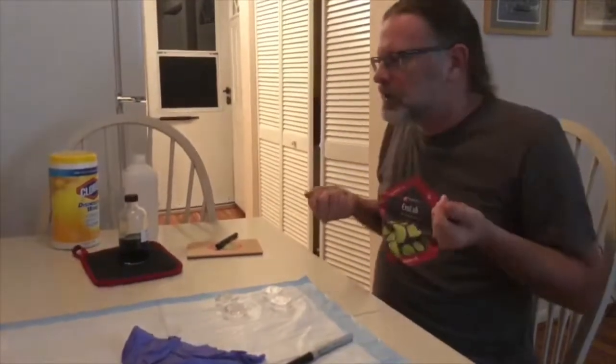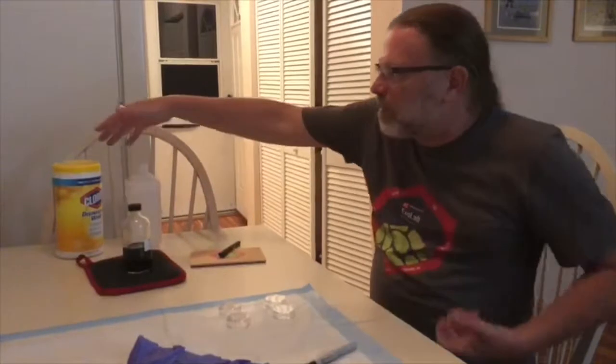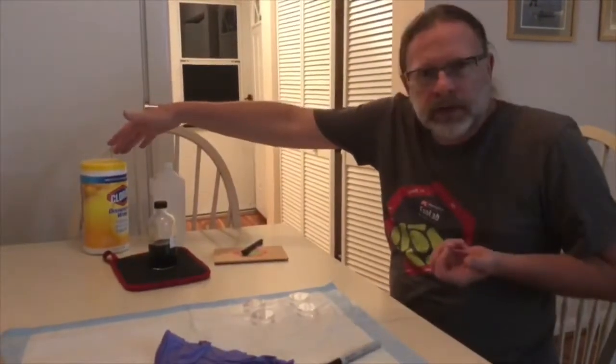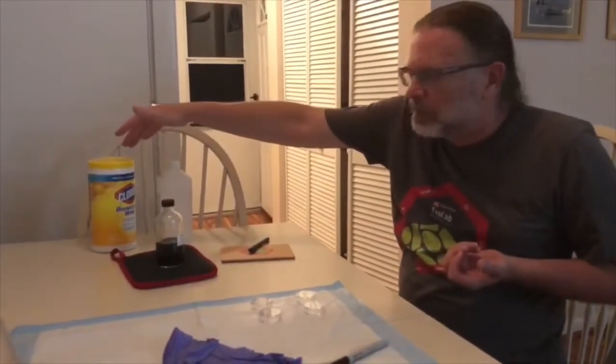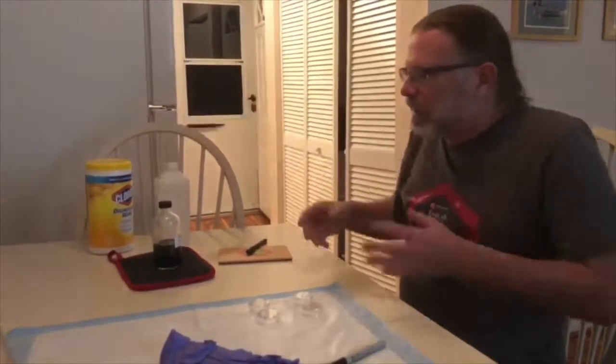My hands have been washed with good disinfectant soap. And then I wipe down the table. I used just the bleach wipes, but you could use rubbing alcohol as well.